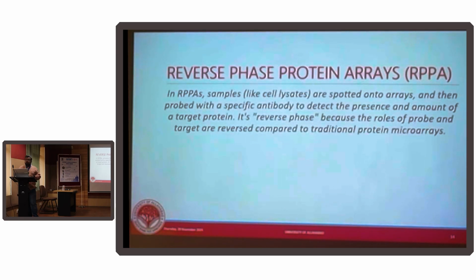Now, you want to try to reach out to your collaborators across India, across the globe, and you want to validate it. Now you cannot ask everybody for a sample and have them ship it back to your lab in India, where you would run thousands of targeted proteomic assays.